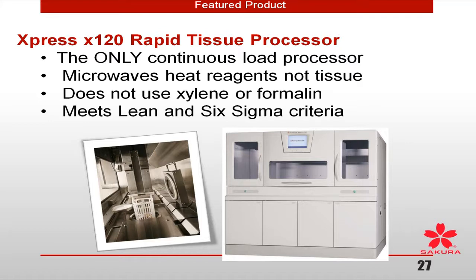So the tools have to be learned. That can take anywhere from a couple of days to several months if you have somebody who's resistant. But eventually you'll move to using, if you're going to use the Sakura, and I will say there are other tools out there from other manufacturers, an assist tool that's going to help you create a consistent size across the sample. Most commonly we use the tissue tack forks. You're going to use those just as a replacement of your forceps a lot of the time. You'll have a blade and a forceps.